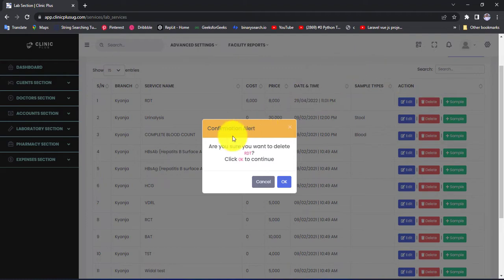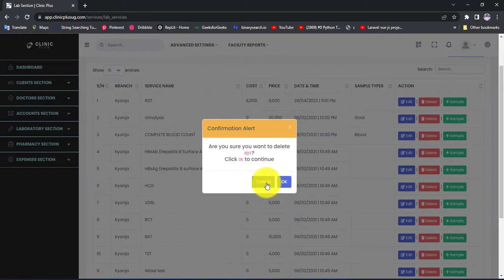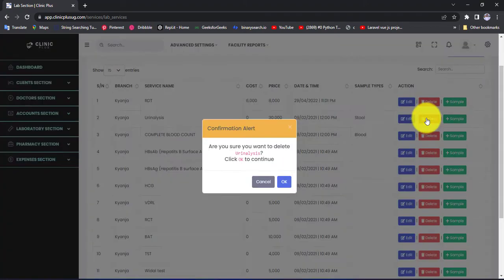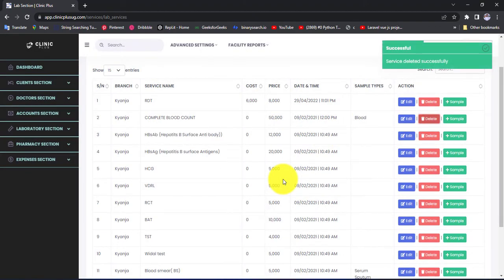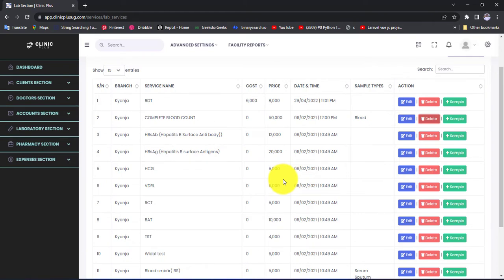You can also delete the service by hitting the delete button. When you hit it, a warning modal will ask if you are really sure you want to delete this service. If you confirm, the service will be removed from the system — just click the OK button. For example, let us delete 'Urinary Sins' — click OK and you can see it is removed from ClinicPlus software.